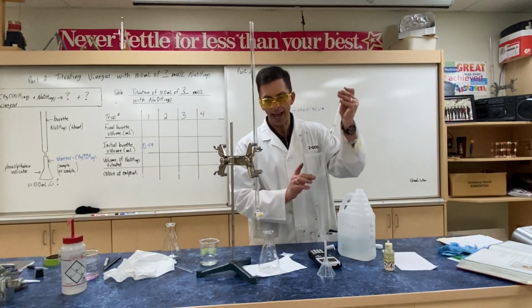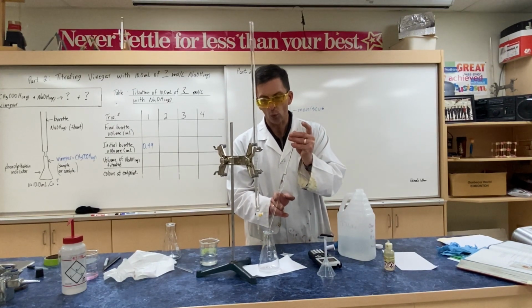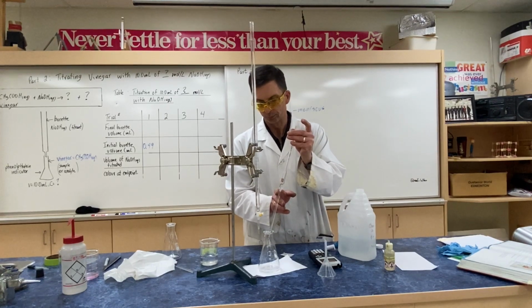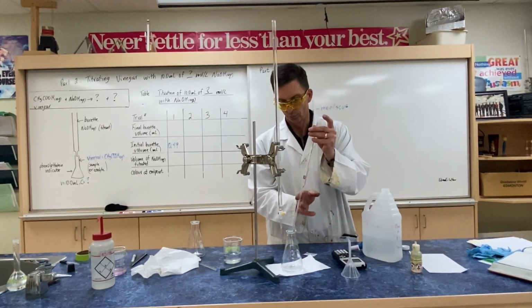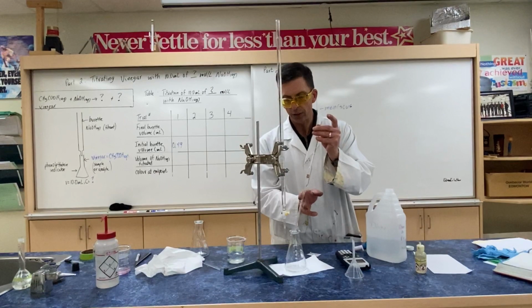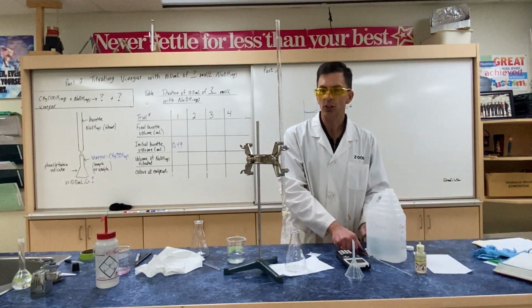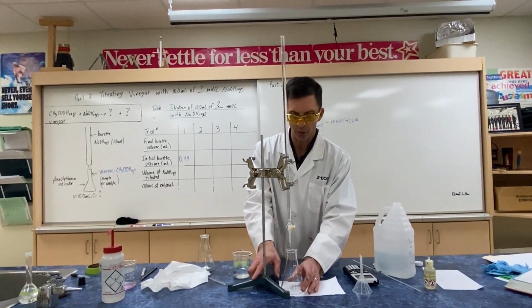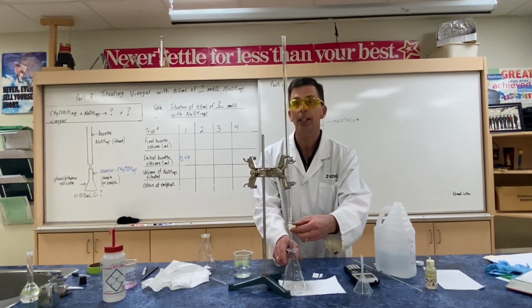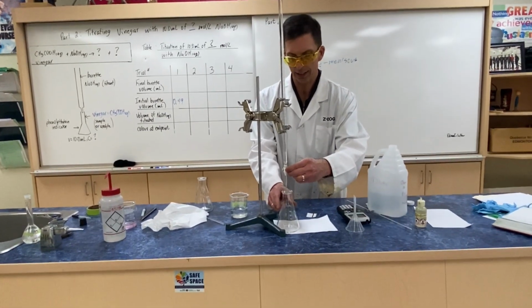Now this vinegar has been diluted 5 times, so we have 1/5 the original stock concentration. You'll see that in the step on the worksheet we're going to make. The last step is to times your final calculation by 5. By diluting it by a factor of 5, it takes less time and less costly sodium hydroxide titrant to reach our endpoint. So I've pipetted 10 milliliters in, and we're going to go through our first trial here on camera.